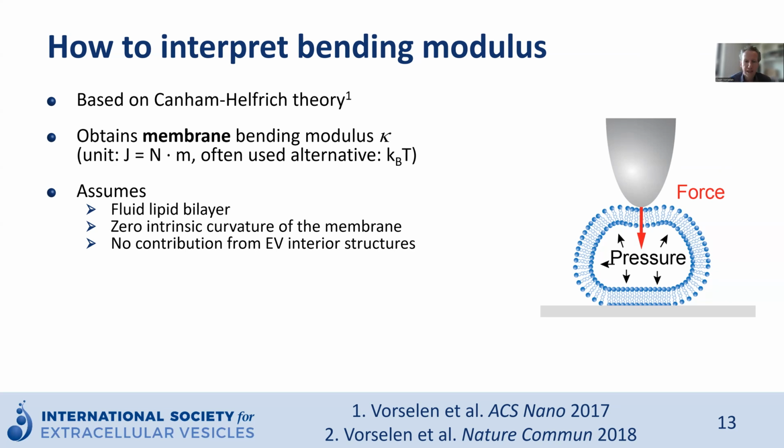During spreading, since the surface area of EVs cannot expand, the volume will have to shrink, leading to an osmotic pressure over the membrane. This is ignored by the previous models, but studies using liposomes and EVs have shown that this is in fact a strong determinant of the vesicle mechanical properties for adherent vesicles.